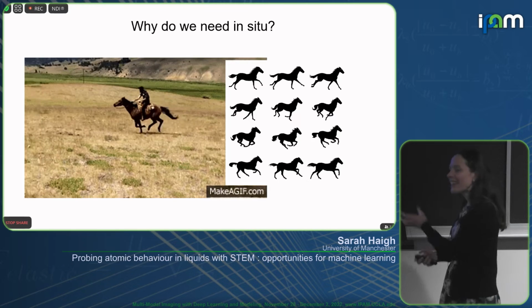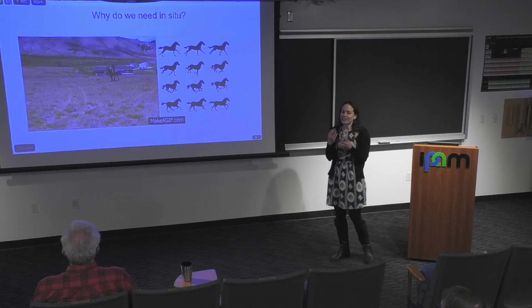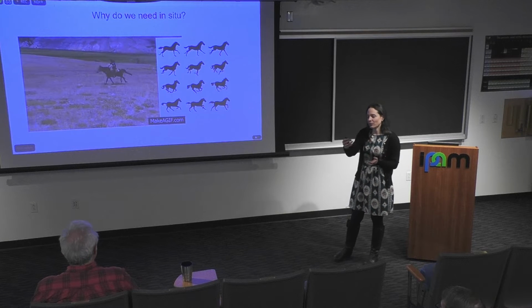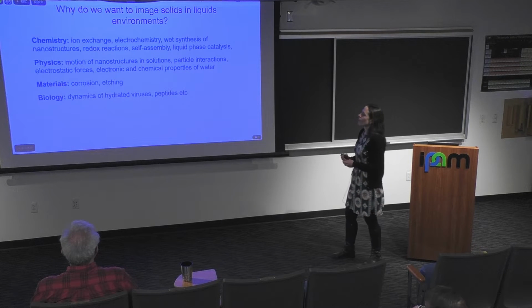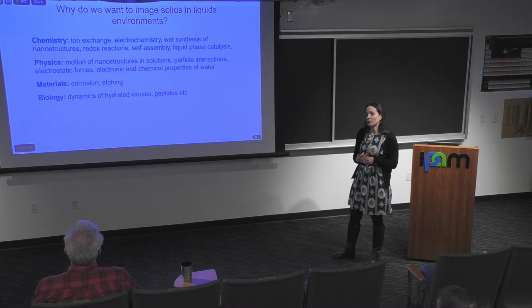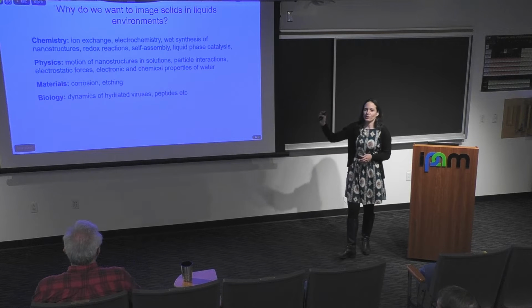So the take-home message from this is that in order to be able to understand the detailed mechanisms of a process, it really helps to be able to image the different stages, and image the same thing at different stages, which is what's special in the TEM. As I said, we're not looking at horses, and for the purpose of this talk, we're interested in processes that happen in liquids, and that's a huge range of processes.